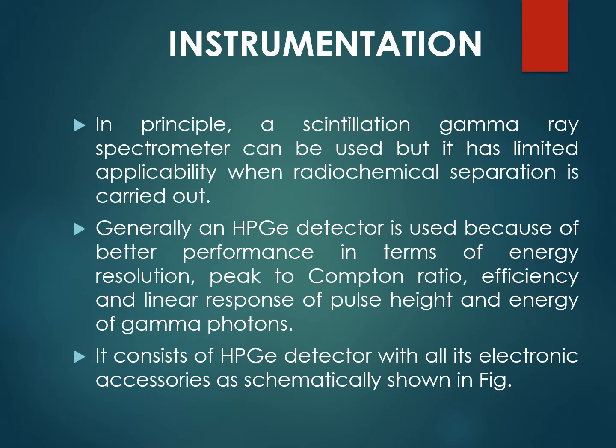These high purity germanium detectors are much more sensitive than silicon detectors. They are much more efficient than silicon detectors for radiation detection, due to the atomic number of germanium being much higher than silicon, and due to the low average energy necessary to create an electron hole pair, which is 3.6 electron volt for silicon and 2.9 electron volt for germanium.